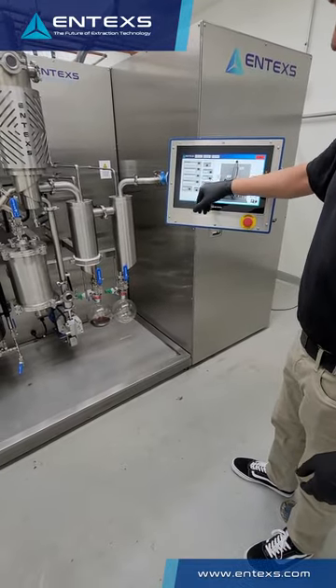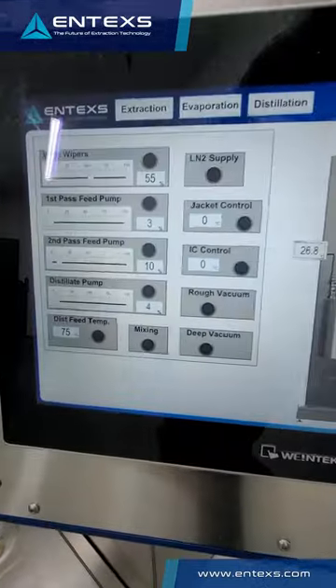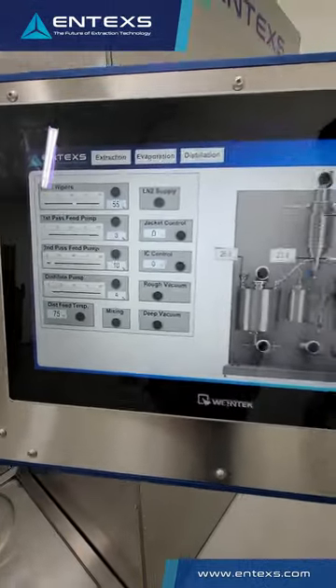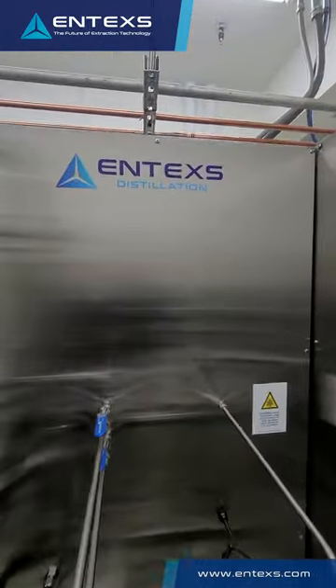All of this is controlled via the HMI. We can control rough vacuum, deep vacuum, all the jacket temps, the wiper speeds, the pump speeds. This really allows you to just set the settings on the equipment and run your distillation process.